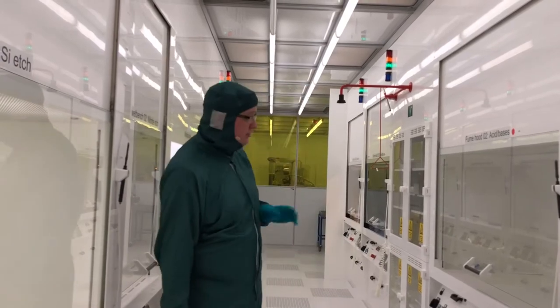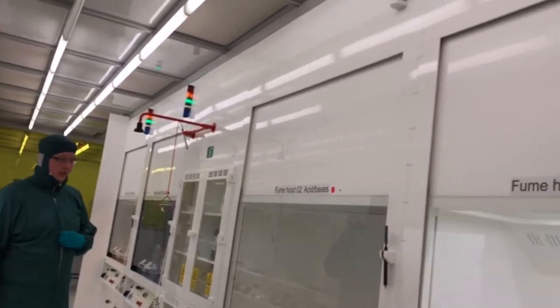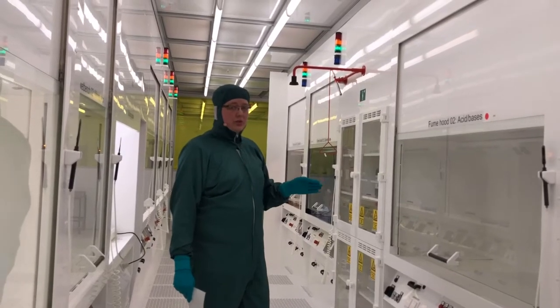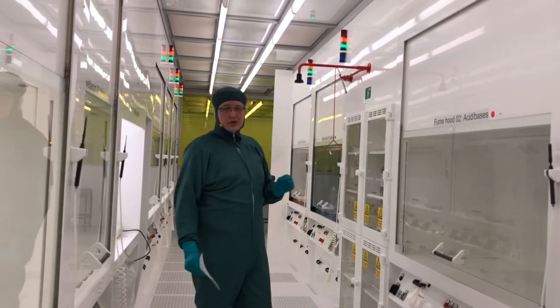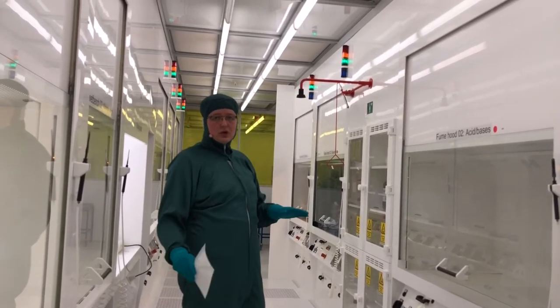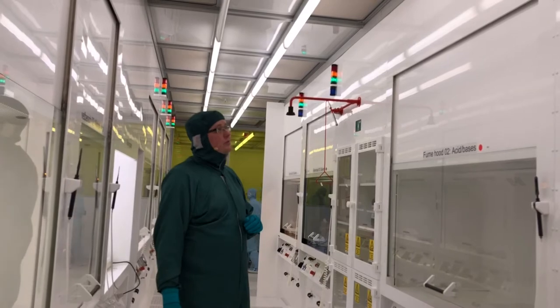Let's look at how to get started using a fume hood or a wet bench. First, check the traffic lights, as they indicate whether the fume hood is ready for use. A red light means either the fume hood is out of use in lab manager due to a problem we are looking into, or that we have exceeded the ventilation capacity in the cleanroom. This is not necessarily a safety problem, but it can be a cleanliness problem, as we need to maintain overpressure in the cleanroom at all times. If you see a red light, please contact Danchip.